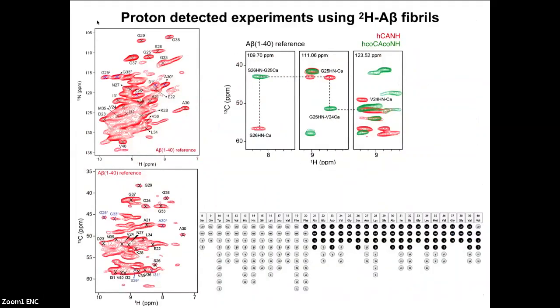So this was just a little excursion for sulindac sulfide. Now let me return to these PET tracer experiments. These spectra show the proton-detected experiments that we did on deuterated amyloid fibers using a 1.3 millimeter rotor and rotating the sample at around 55 to 60 kilohertz. And the spectra that I will show you come in two flavors.